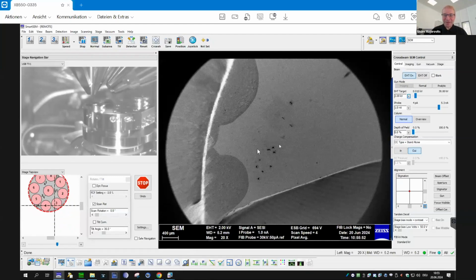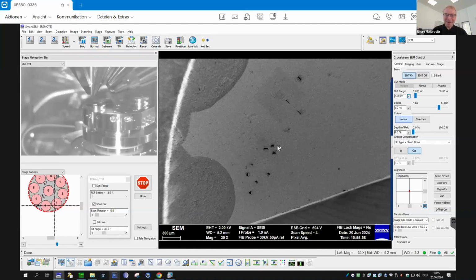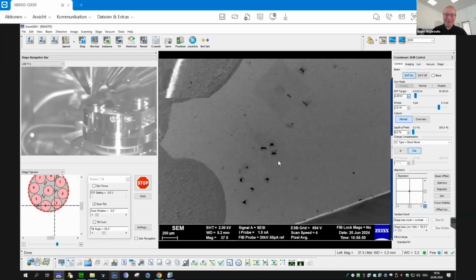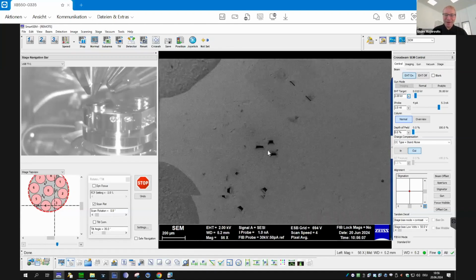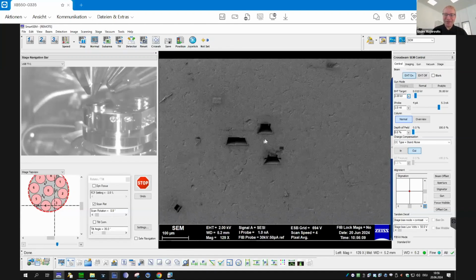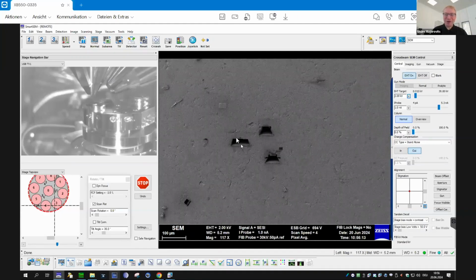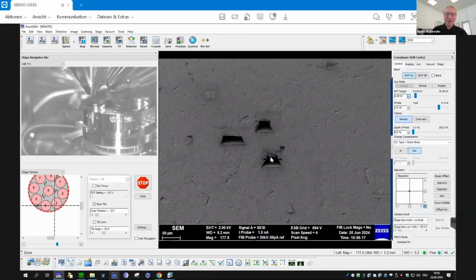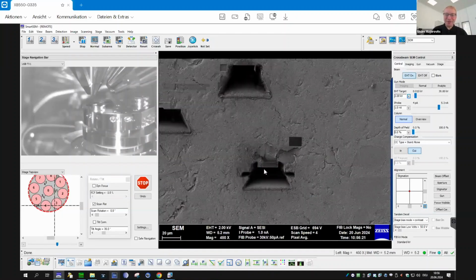Okay, so basically, I zoomed out a lot now. So you see there's a chunk of resin-embedded HeLa cells, which is attached to a stub using silver paste, which you see over here and over here. And as you also can tell, I have already milled not only one, but several trenches into this HeLa cell sample in order to collect 3D data. And this is my use case.